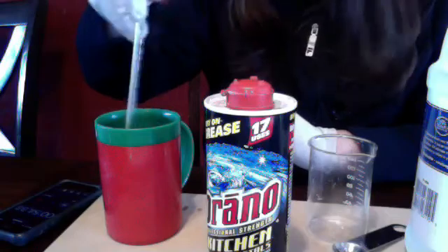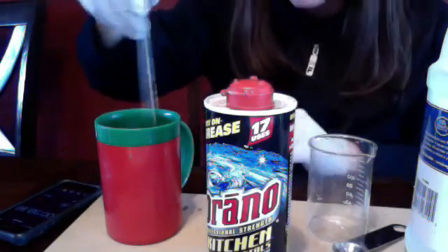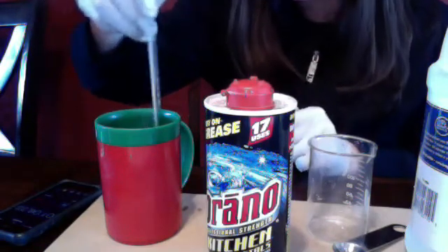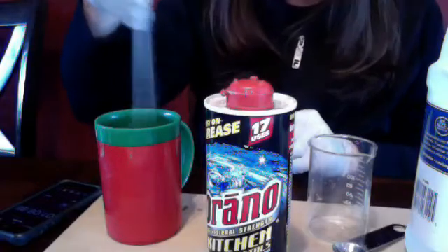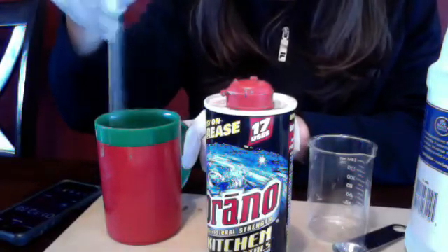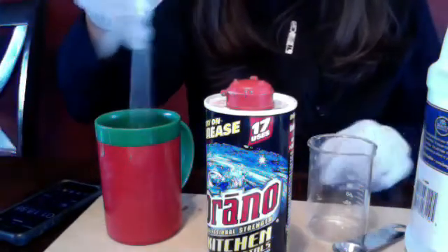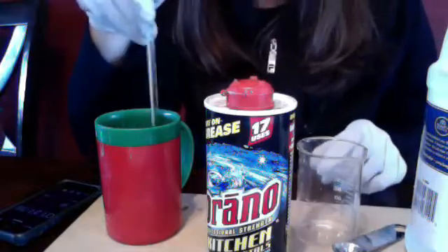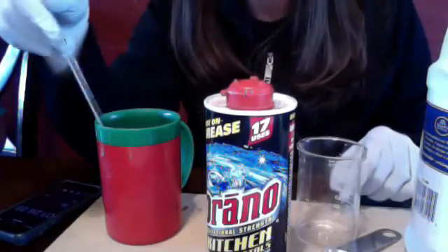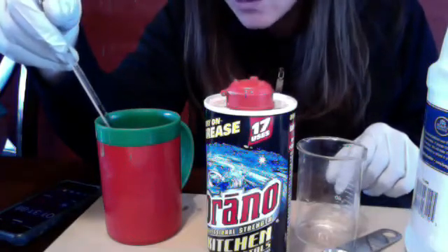We're still slightly climbing. I wish you guys could do these experiments on your own. Okay, we are now at the second 30-second mark at 22 degrees Celsius. It might only go one more — it doesn't seem like we're really getting a ton of increase here anymore. All right, we are at our next 30 seconds — we're at 22 again.